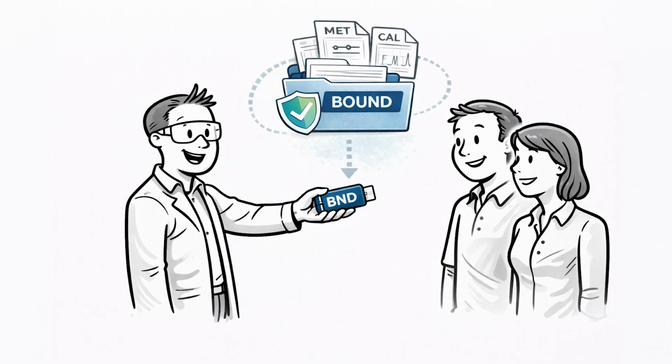One final practical advantage. Because a bound file contains the method file, calibration file, and format configuration internally, sharing data with colleagues or Chromperfect support is significantly simpler. Everything required to reproduce the analysis is contained within a single bound file.